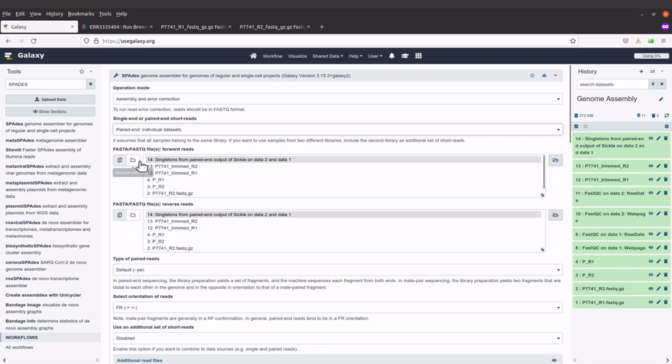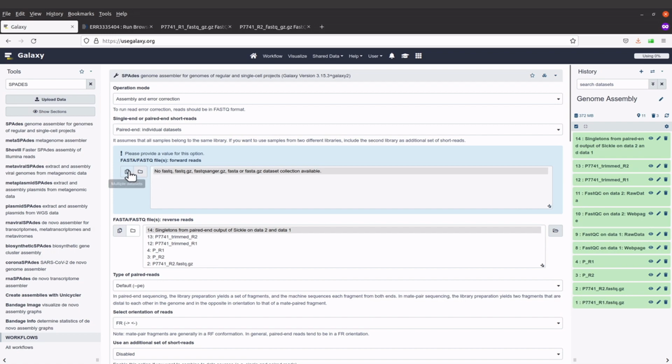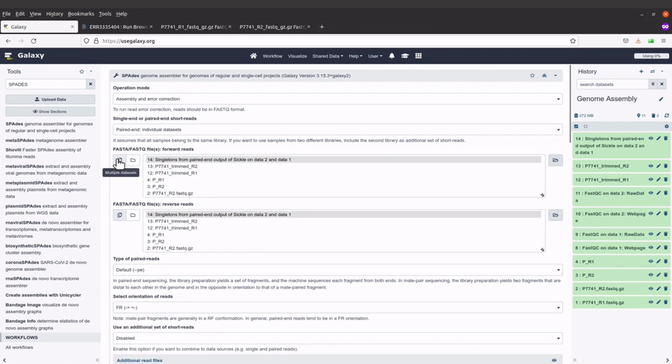And then when I come here, I'm supposed to choose the data that I want. So I'll just come to this side and I'll select the ones that are of interest to me. So here it says multiple data sets, and here it says data set collection. Okay, I'll also use the browse feature here. So I'll come to the right side here.